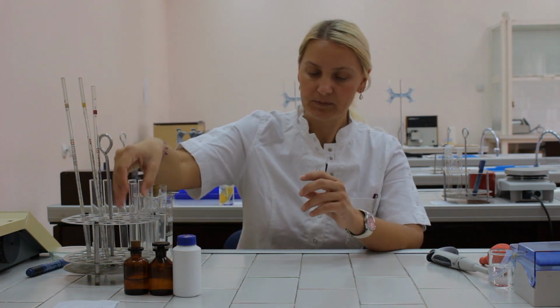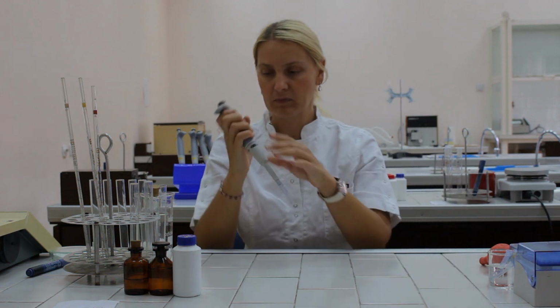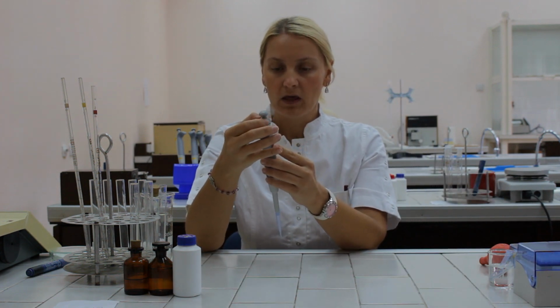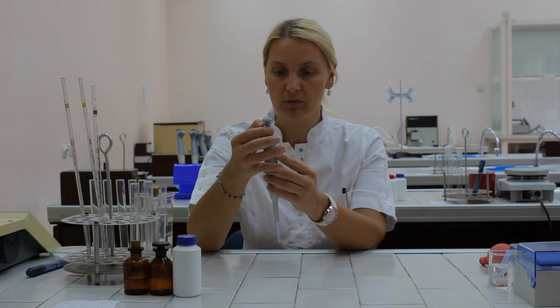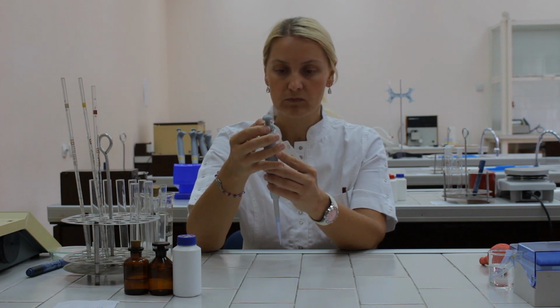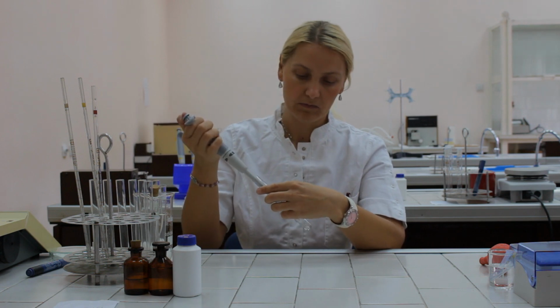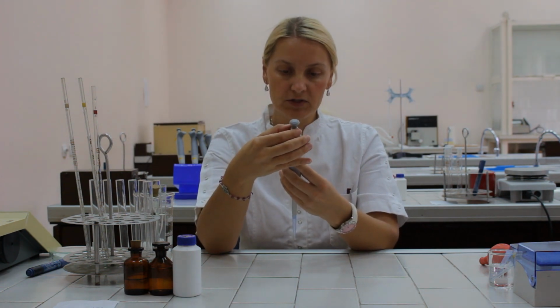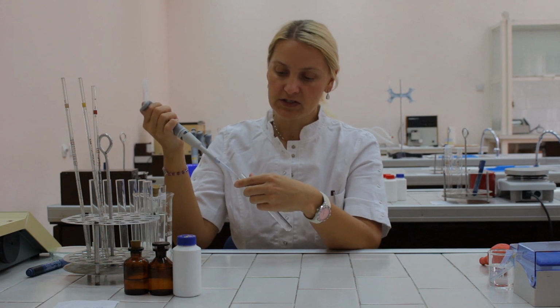Now we have to dilute this standard solution with certain amounts of water, again by using the micropipette. In order to get 1 milliliter solution in each test tube, we have to pipette 900 microliters of distilled and deionized water to the test tube number 1. Then 800 microliters to the test tube number 2.